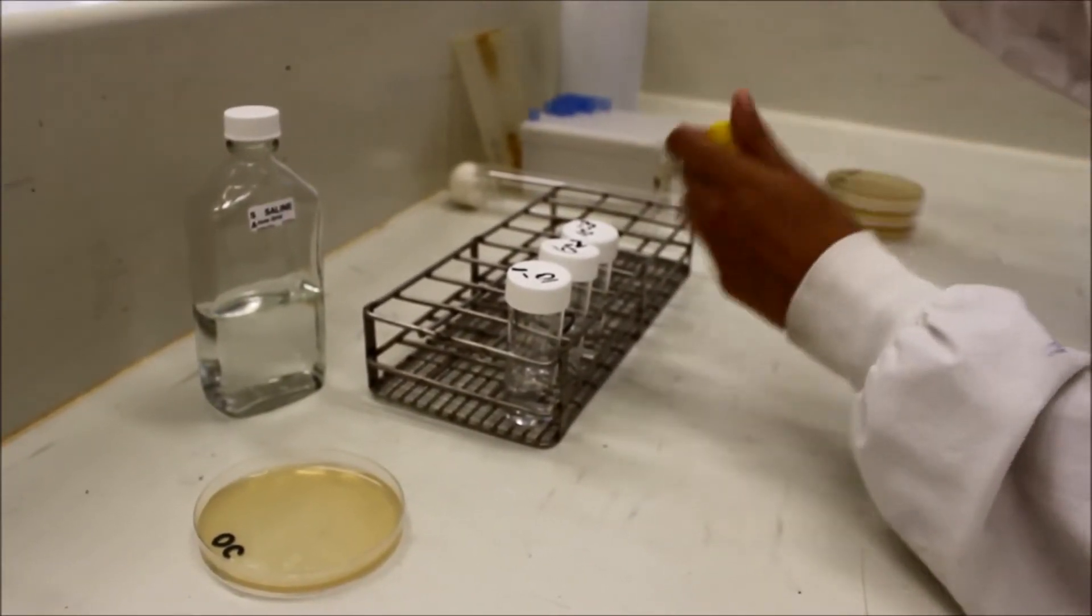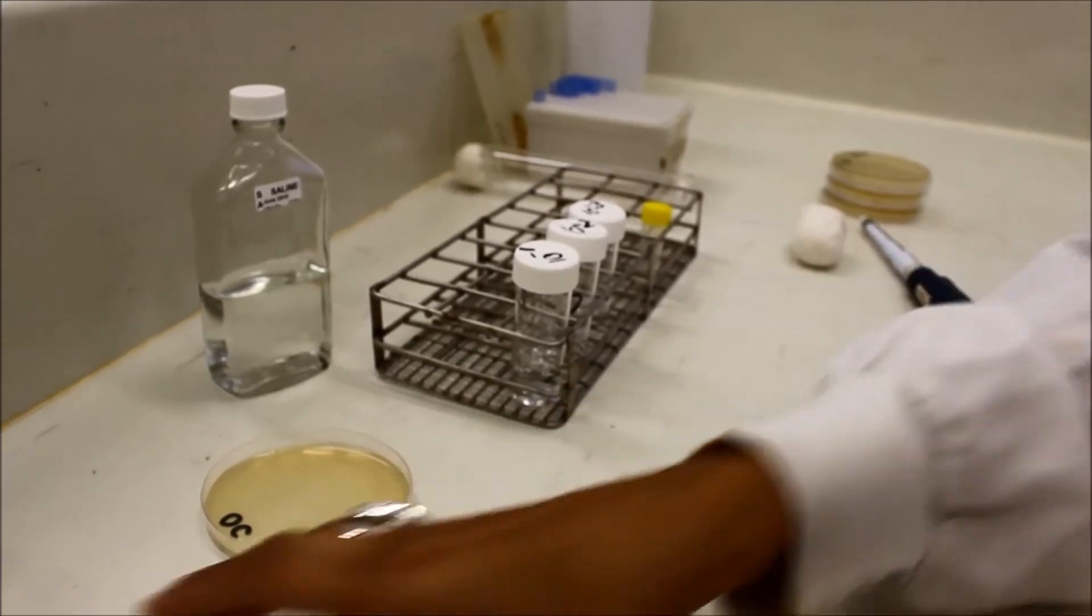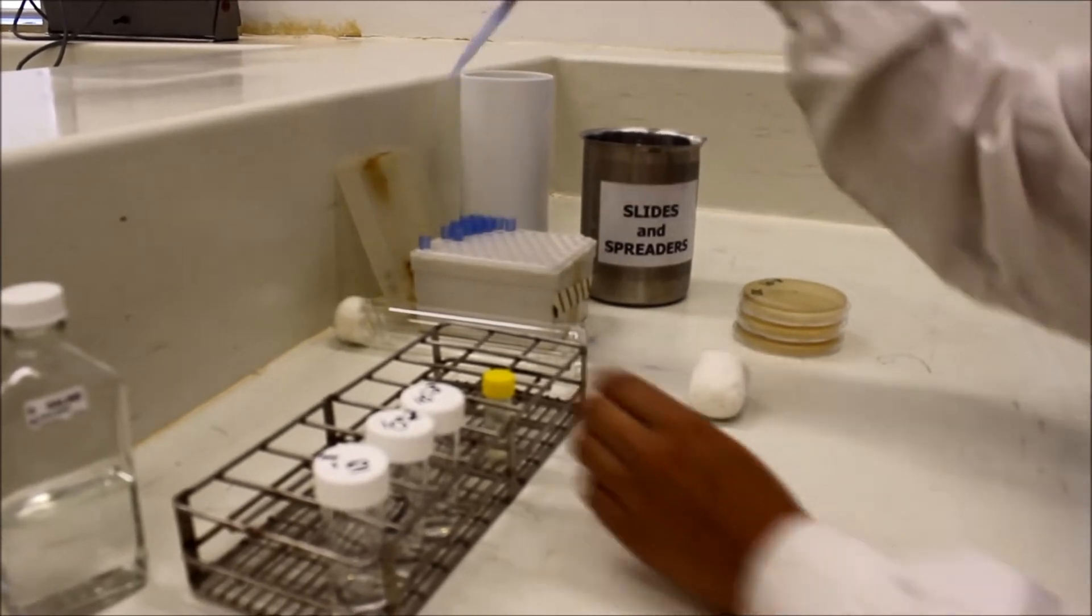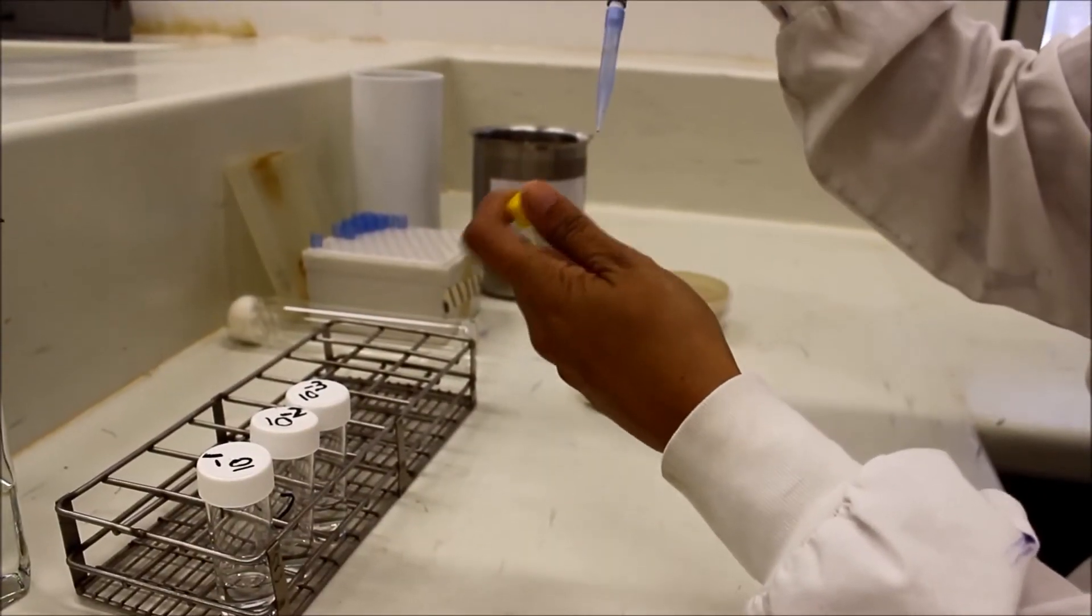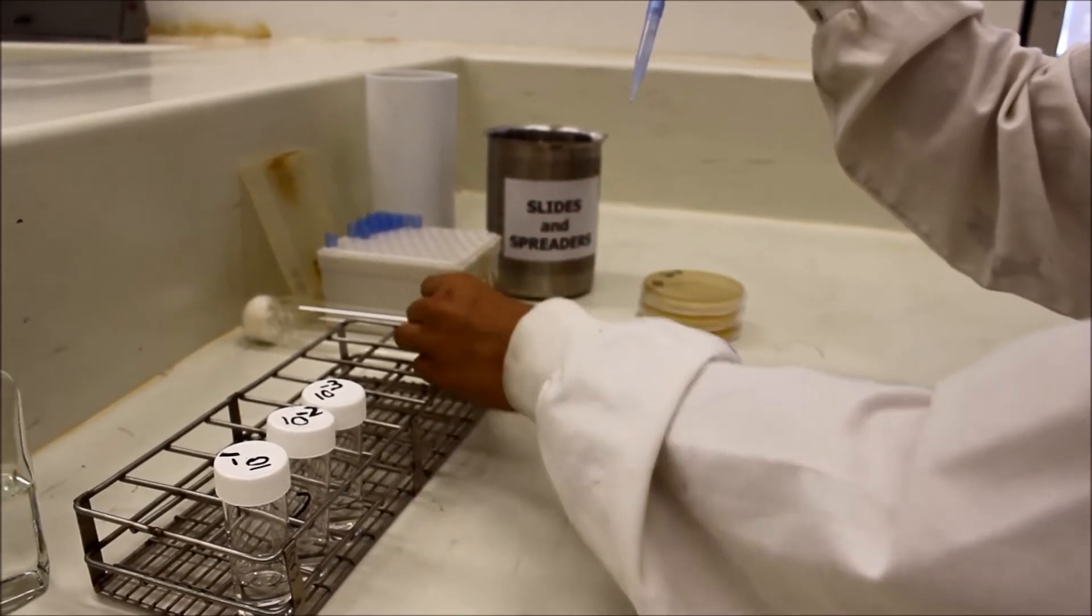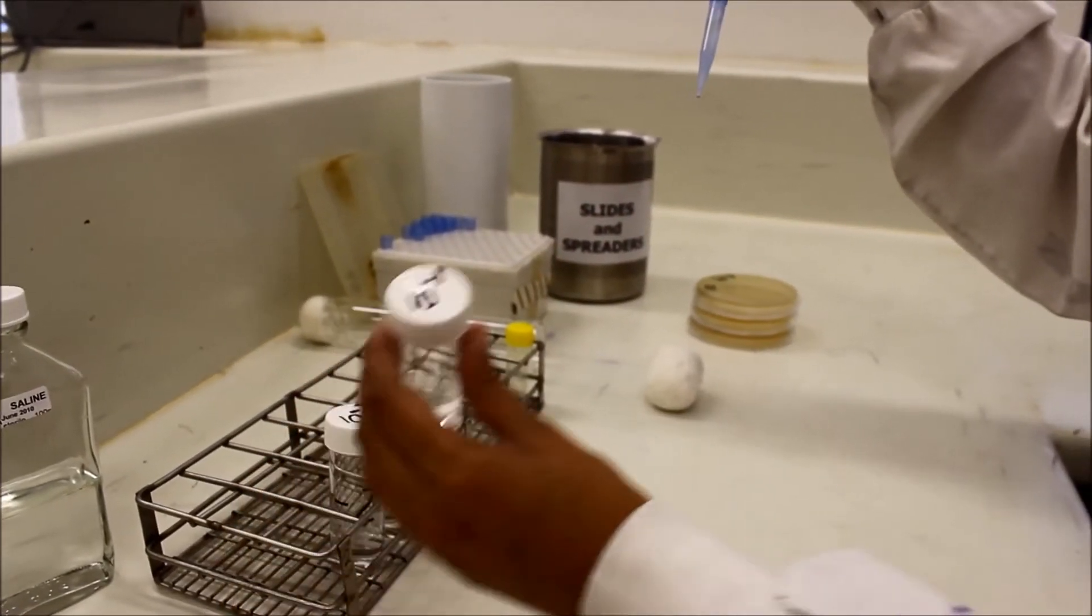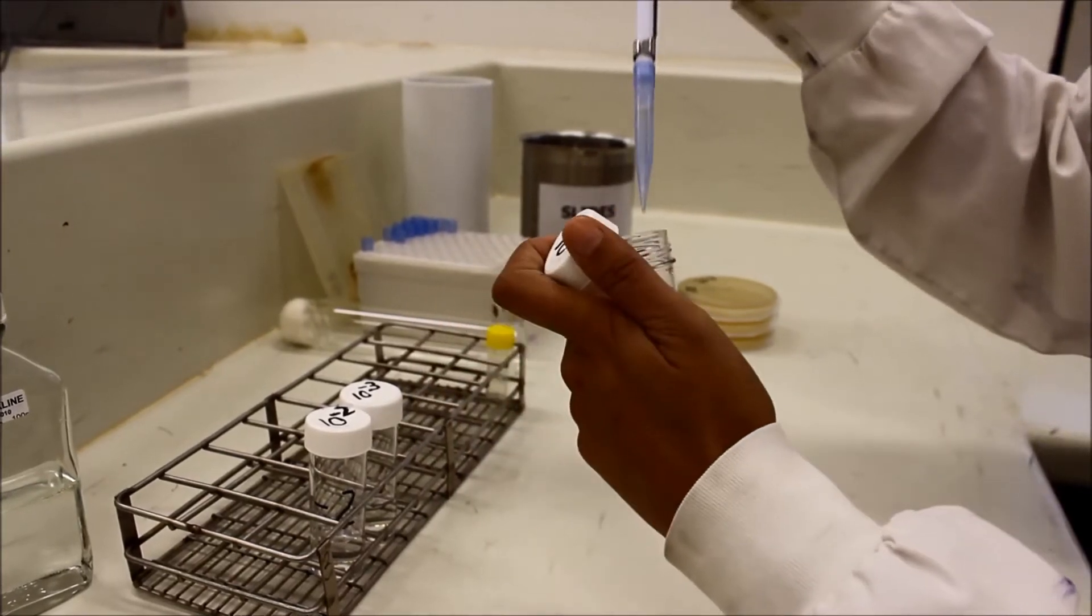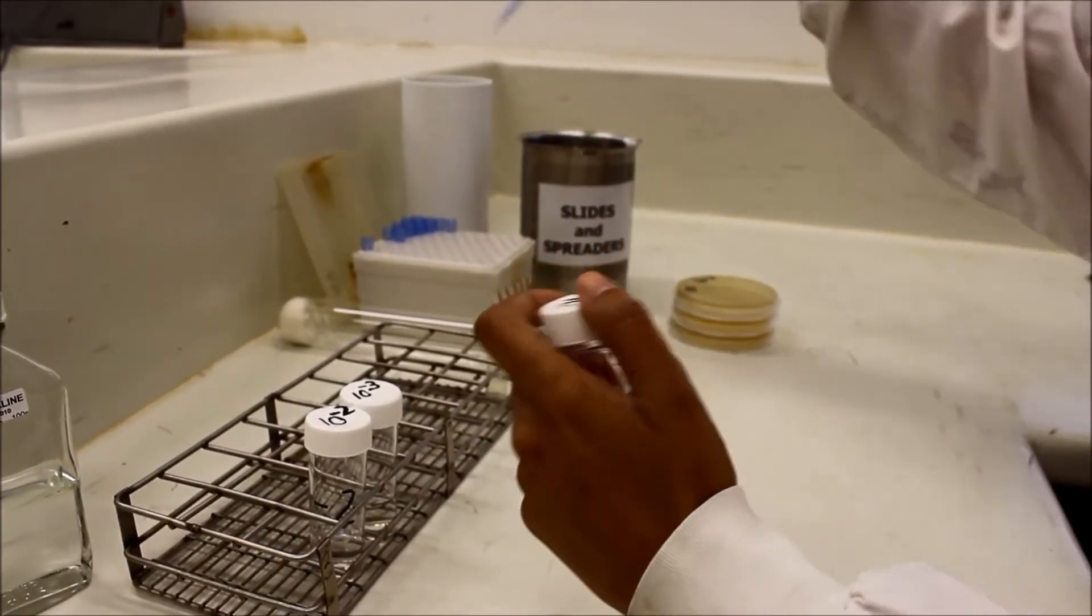When you are done, make sure to replace the lid of your plate. Use one milliliter of these pooled washes in your first 1 in 10 dilution. Make sure you mix thoroughly between dilutions.